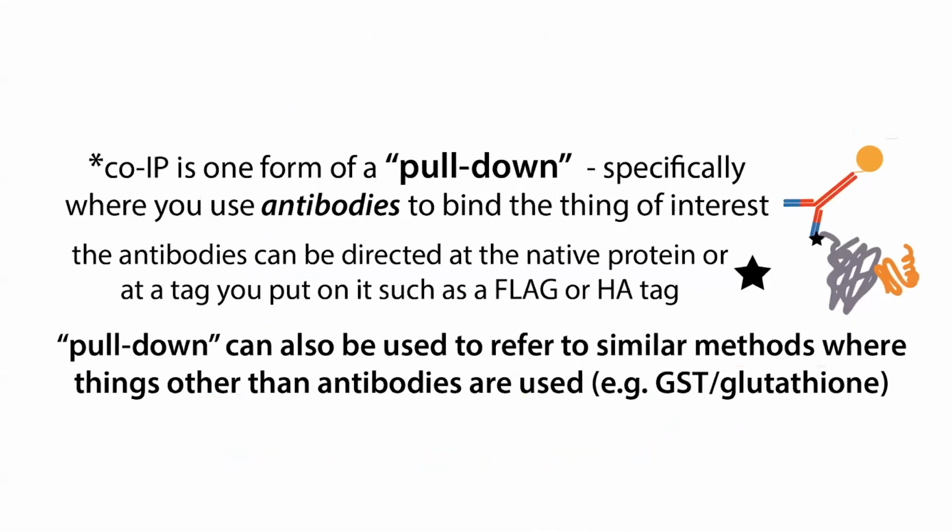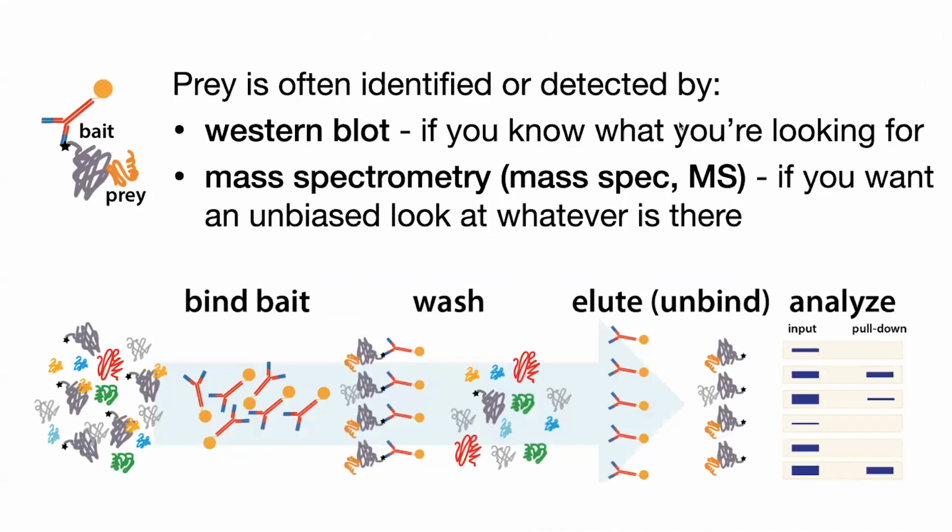Similarly, if you want to capture biotinylated DNA or RNA, you can use streptavidin-coated beads. There are a variety of different options. And again, all of these have the same principle in mind. We're going to bind that bait.